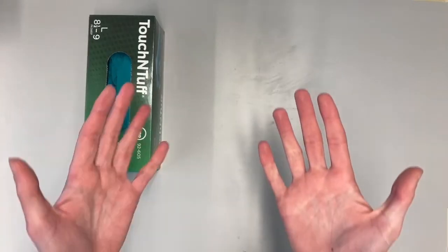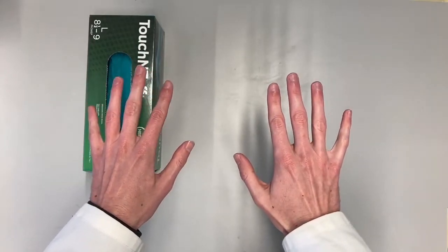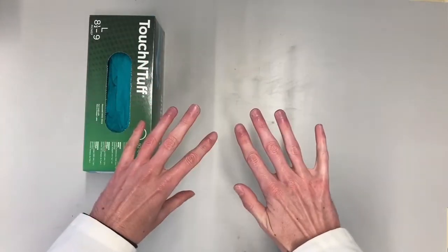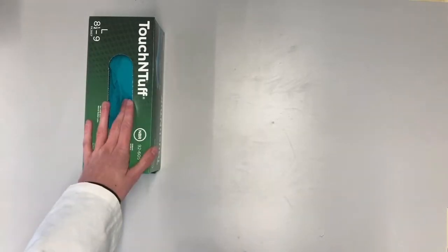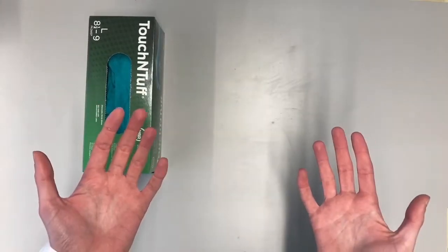These gloves are there to protect your hands. You have two hands — most people at least — and they are very expensive to repair or to replace. And these gloves are very cheap to replace, so we use gloves to protect our hands against any chemicals in the lab.